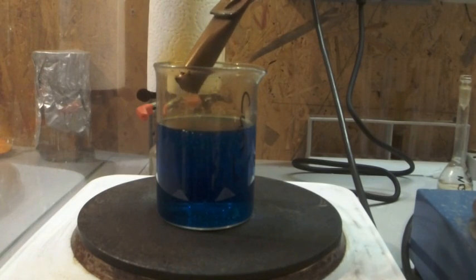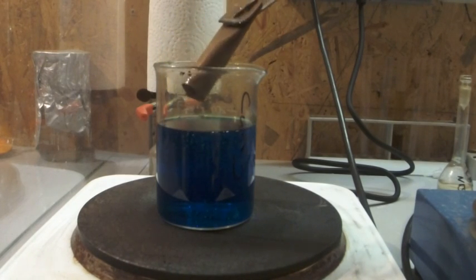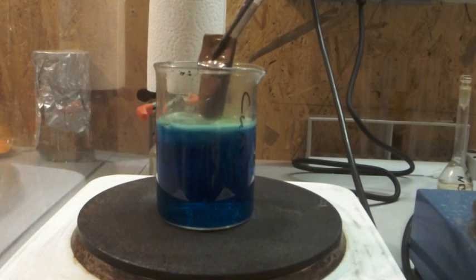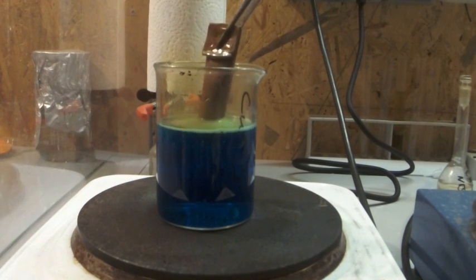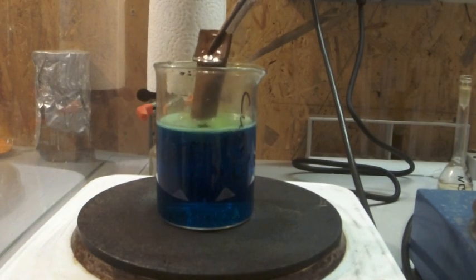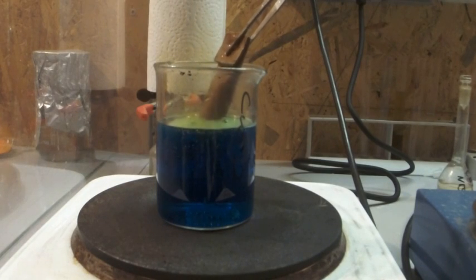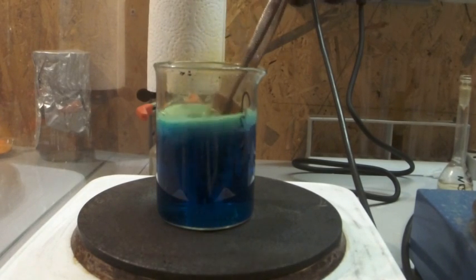But to show you the other method as well, I dissolved some copper in the still strongly acidic copper nitrate solution from the last step. As you can clearly see, brown nitrogen oxides are forming which decreases the yield based on the nitric acid.